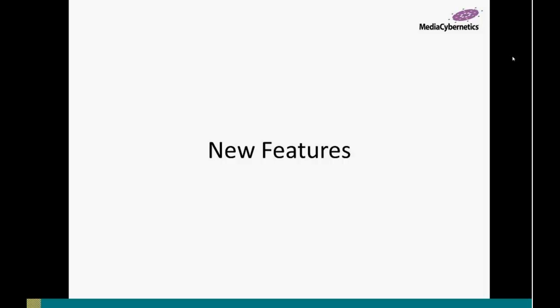So to kick off some of the new features and talk about what we have here today, I'm going to turn it over to my colleague, Jeff Knight, and pass control over to him so he can begin to show us how ImagePro Premiere 9.1 can make some changes for all of us in our workflow, improve how we do things, and get us some really incredible innovations. Thank you, Jeff. I'm going to go ahead and pass control over to you.